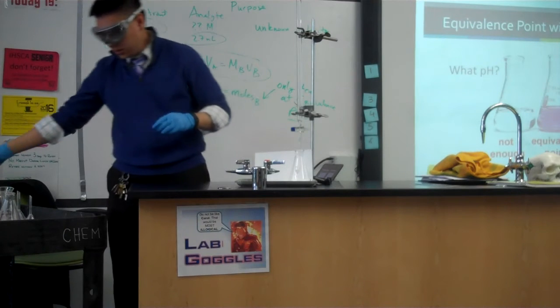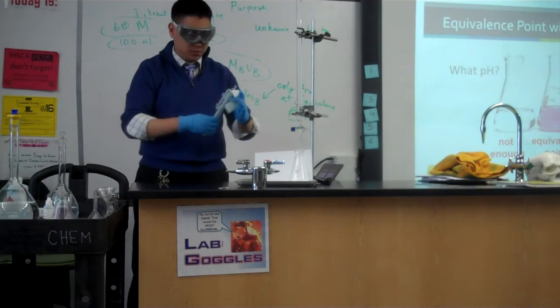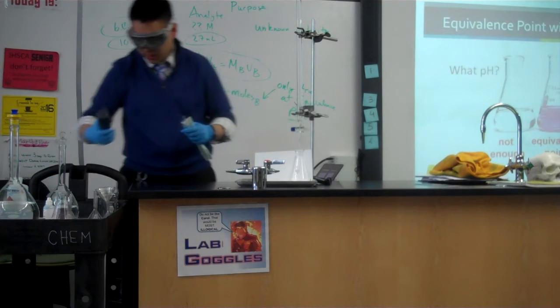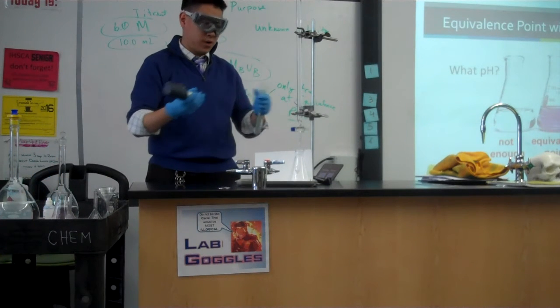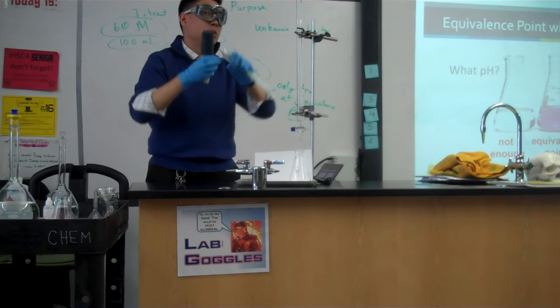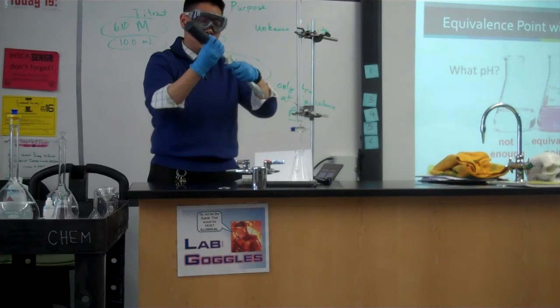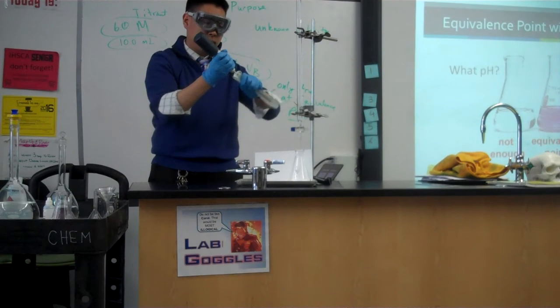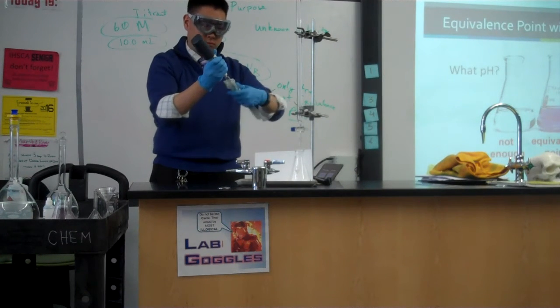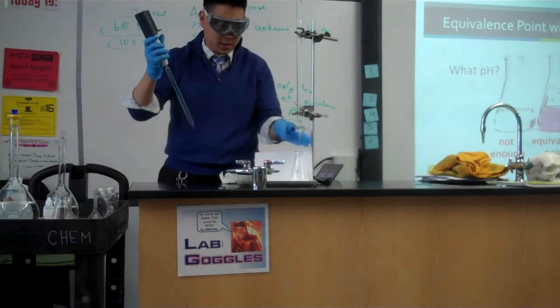Okay, other things we have today. As much as I love your pipette bulbs, I realize they're going to be hard to do since we're doing 3 trials. So this is called a pipette helper. Instead of using a bulb, pushing it out, sucking it up, pushing more air out, we'll use this. Pretty much the same function, except very easy to use. Pipette helper? Pipette helper. Yep. Helper, like a handy helper.